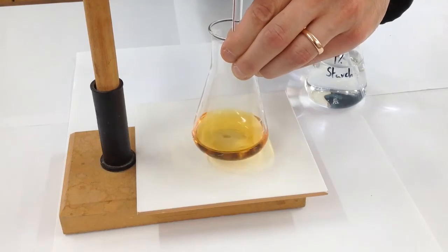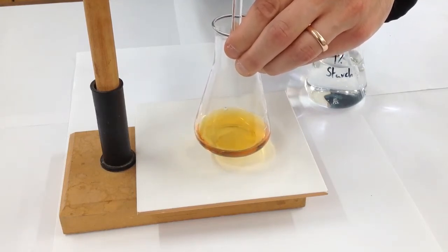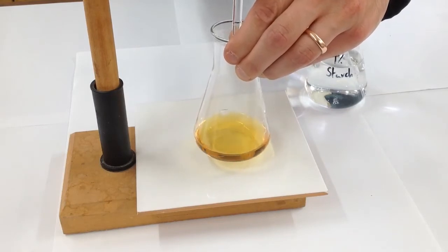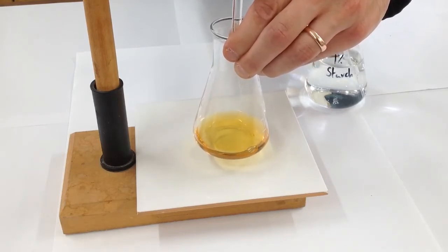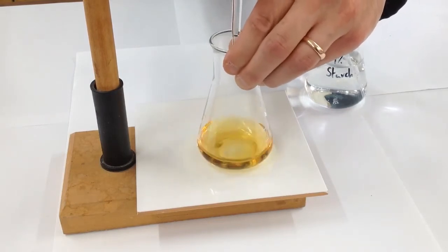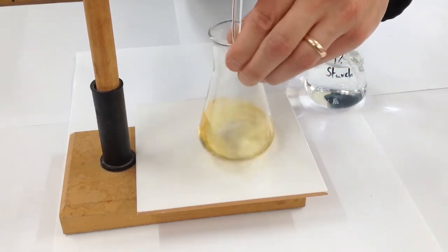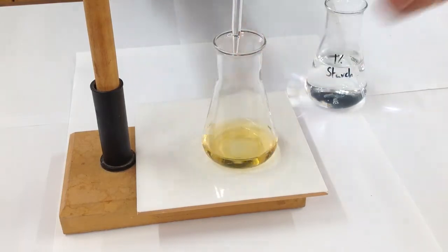Yeah, I think just another drop or 2 more. There we go. So now we're ready for just 1 more drop. Yeah, there we are, ready to add our starch.